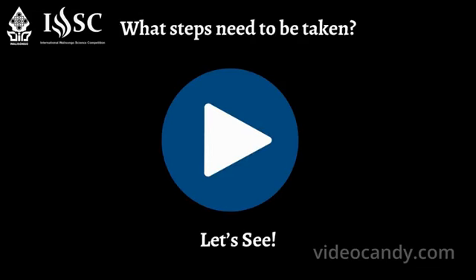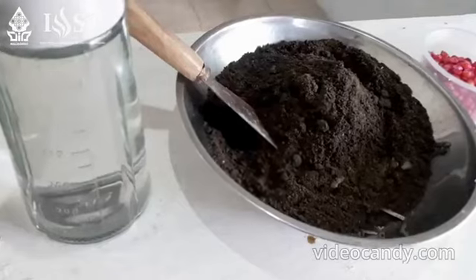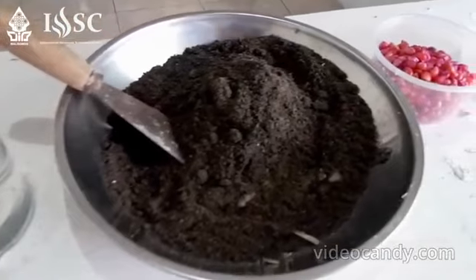Each substrate was tested under two lighting conditions, light and dark. The observed parameters include germination rate, root length, and early seedling morphology. What steps need to be taken? Let's see. The following is the process of making the substrate from soil.